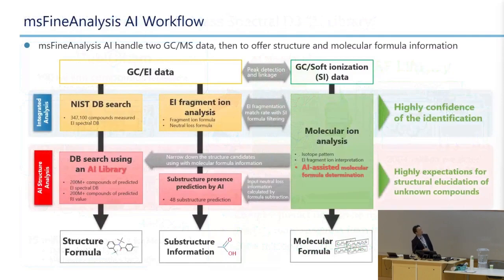Okay, and I'm showing our AI workflow again. In this workflow, the molecular ion analysis result is quite important for both the integrated analysis and the AI library analysis, because we use the molecular formula information to narrow down the candidates.